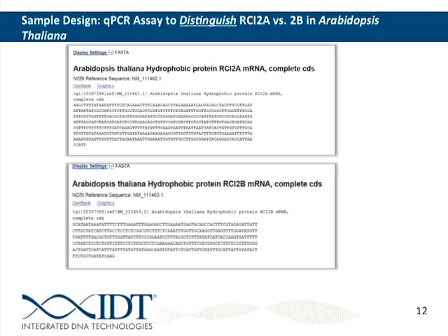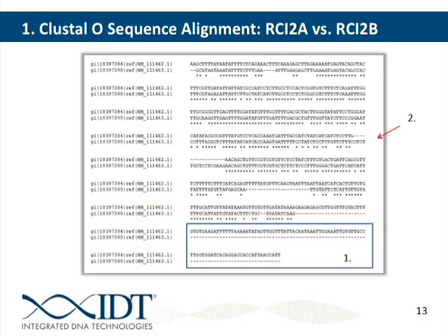And so bear with me as I access the sequences and we put those into our Clustal program to align them. So I've already downloaded these from NCBI. I just went to NCBI. You can either find them by this identifier or by typing in your organism and gene of interest. And then we can just copy and paste that information. Actually, you can copy it directly from NCBI as well.